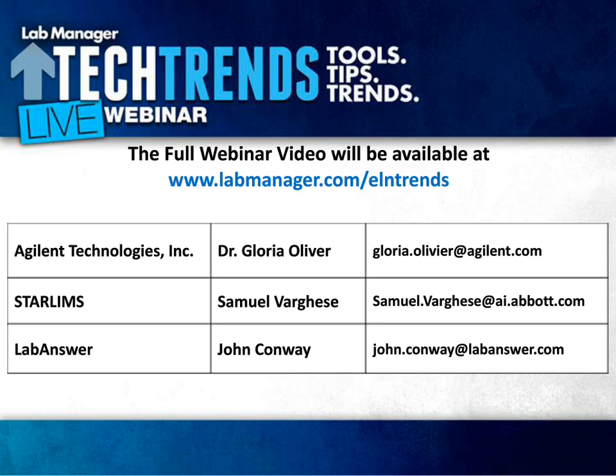Thank you. John, you mentioned that getting buy-in from employees was important when you're implementing an ELN system. What advice can you give for getting the team on board? Yeah, I think everyone has seen the adoption curve that's out there. You really have to select your technologists. You have to select people that are excited about the change that's coming, and they can see what the future could bring. You have to get them on board early, and I stress, you have to be able to show the value.